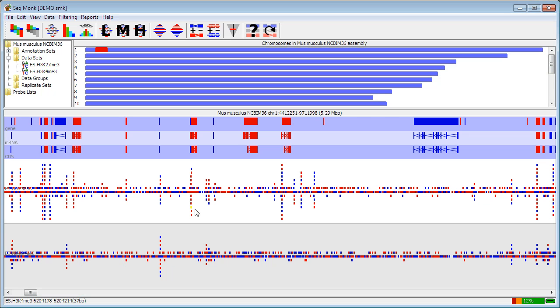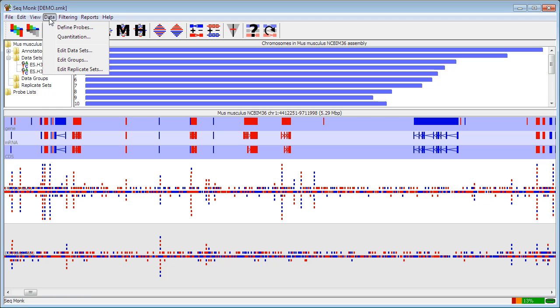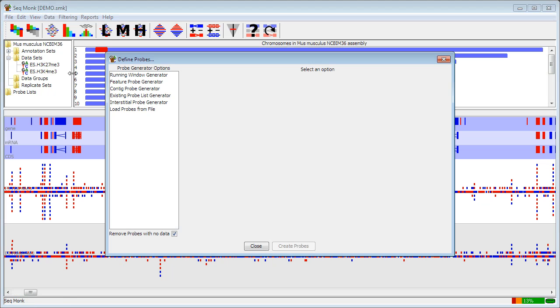Quantitation in SeqMonk happens in two stages. In the first stage, we can go into data and define probes, and that allows us to specify a set of regions within the genome over which we're going to make measurements. So these are termed probes within the program.